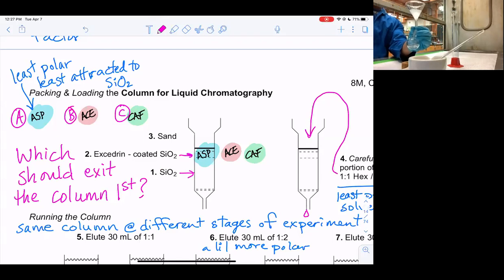Yeah, now I can. So there's cotton here in the funnel. That's to trap any of the insoluble stuff. That way it doesn't go through with my soluble components. And nice, so it's a little slower than it should have been. I probably had a little too much cotton. But on the bright side, nothing we don't want is going to come through here.